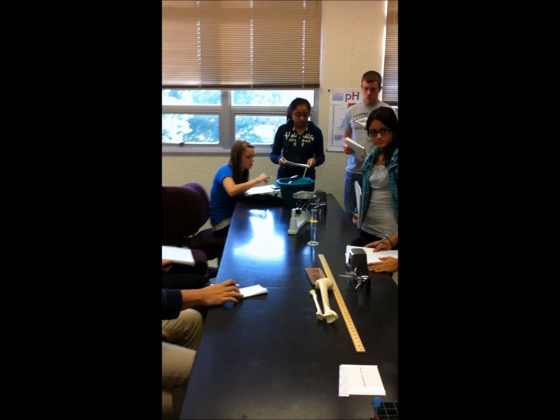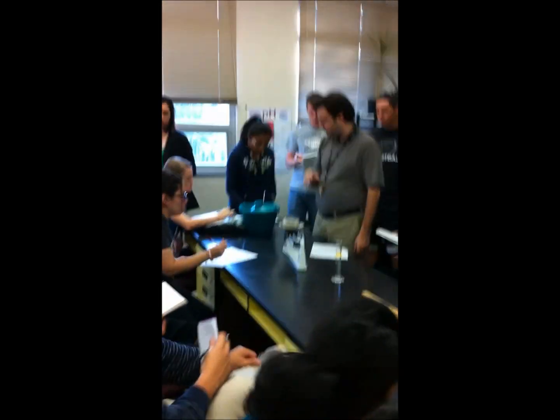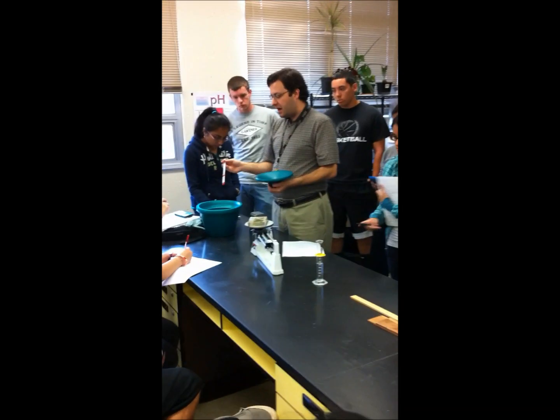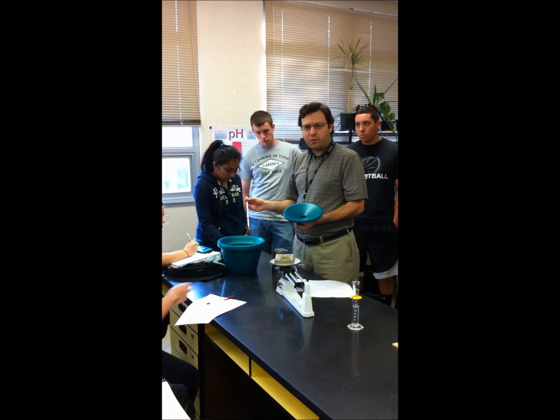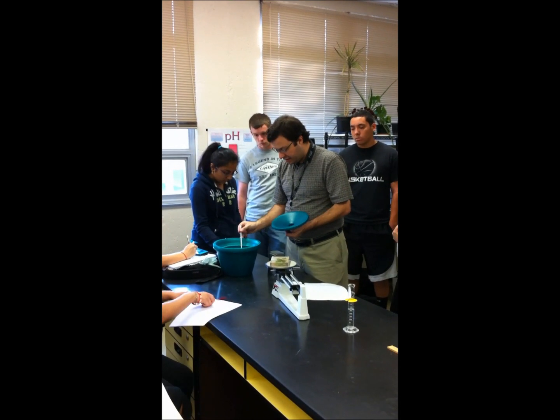Currently, we are still on lab number 1. Okay, measurements here are always done in the metric system. Temperature is always done in Celsius. They are going to ask you for the boiling point and the freezing point of water in both Celsius and Fahrenheit, so be sure to memorize that.